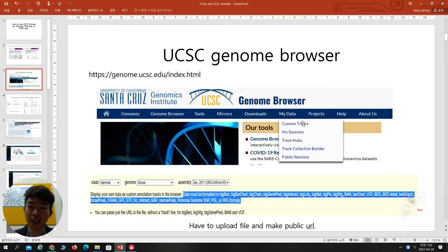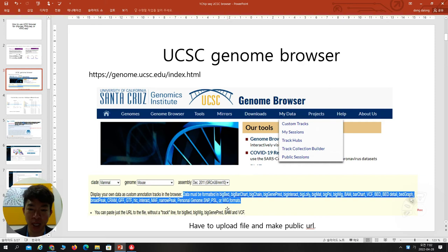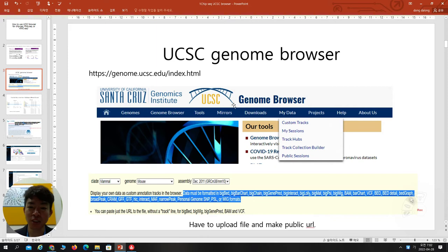Under 'My Data' and 'Custom Track,' you have to upload a certain kind of file to make those displays. The UCSC browser only allows display from certain formats: BigWig, BigBed, BAM, and similar files. You cannot directly upload these files into the UCSC browser — first, you have to upload them to another public site, and then you can only copy and paste the URL.